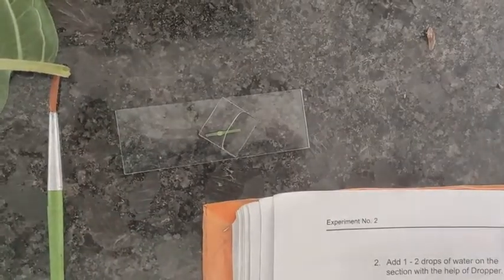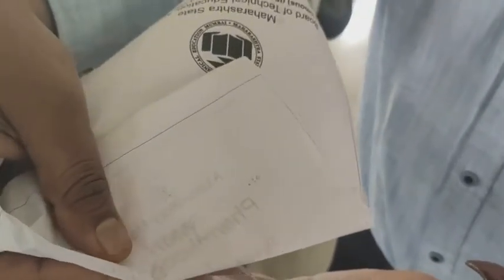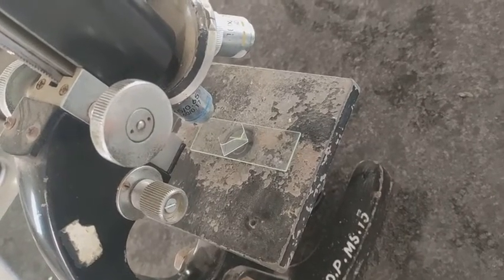If there is excess water, then swab it with the help of filter paper. In this way your slide is ready for observation, and then keep this slide on the stage to observe the section.